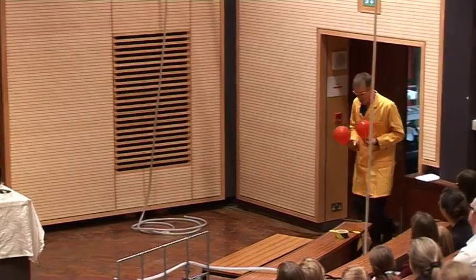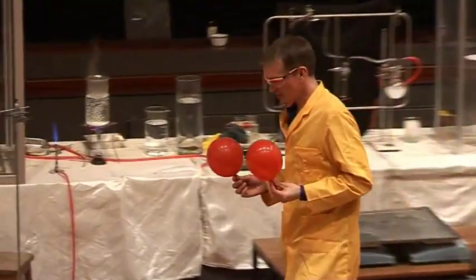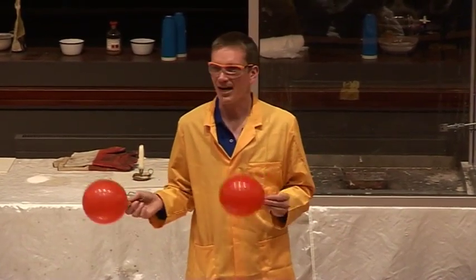Right, I have two balloons here. They both look just the same. One of these is filled with air, and one of them is filled with hydrogen. Now, which one's which? How can we tell?